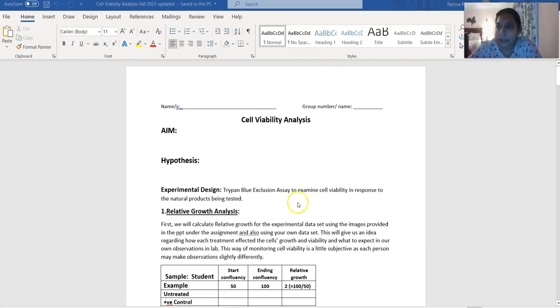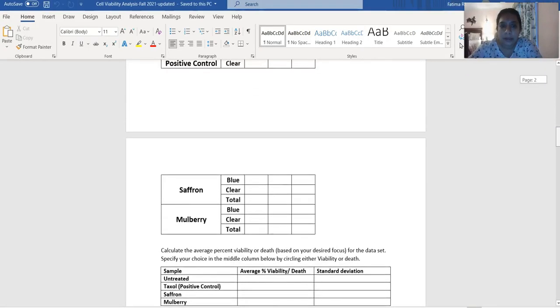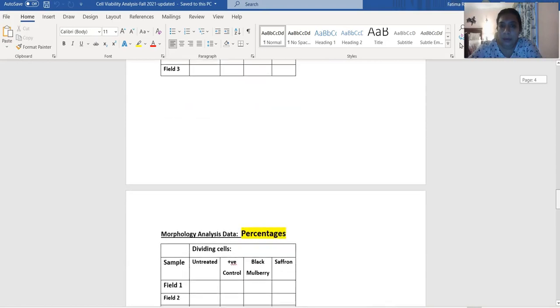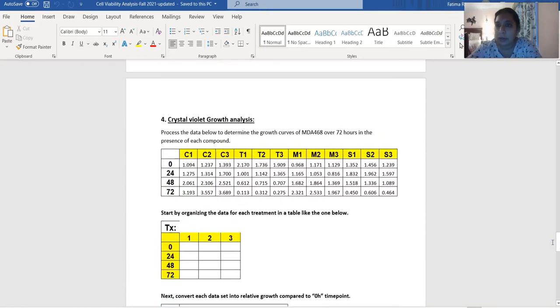I know there are a lot of questions about how to analyze the crystal violet data, so I'm going to go over that quickly with you guys in this video. Hopefully that will help you process it a little bit easier.